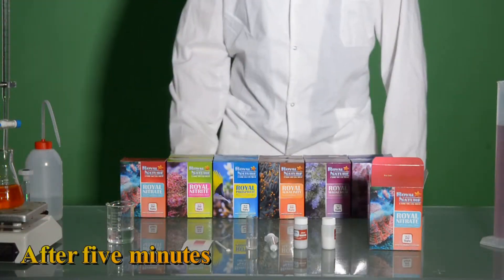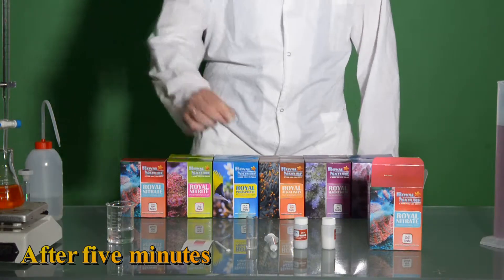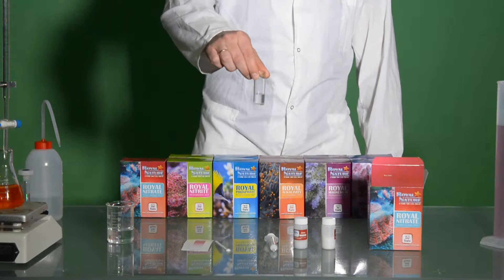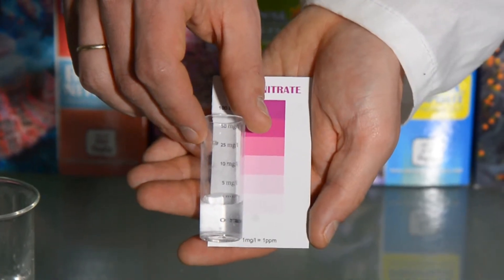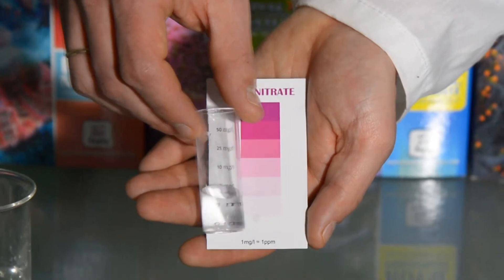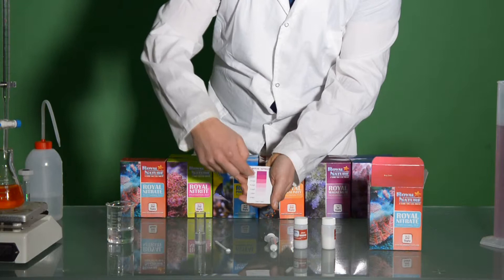After 5 minutes, we'll take the test vial and hold it next to the supplied color chart on the white part of the chart, comparing the colors looking from the side of the test vial. We'll read the corresponding nitrate content. An intermediate color corresponds to intermediate nitrate content.